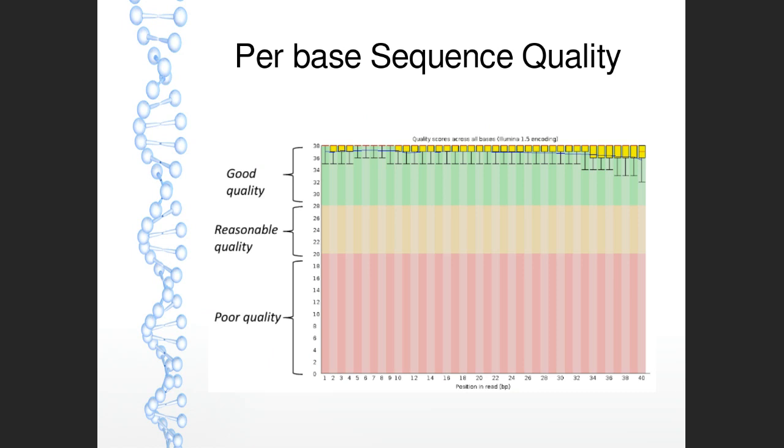and when you run through the practical, you'll find this is the first item in the FastQC report, which is generated as a HTML file that we can look at with our web browser. Now, this plot gives us a Phred score per position within our reads. So we've got lots of reads within our data file, and this is a kind of average quality score at each position within that read.